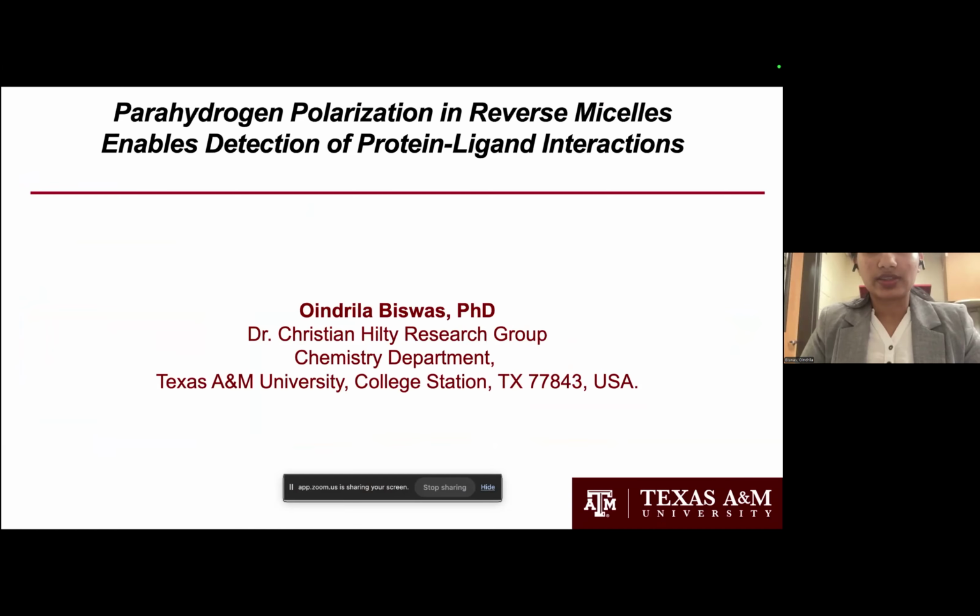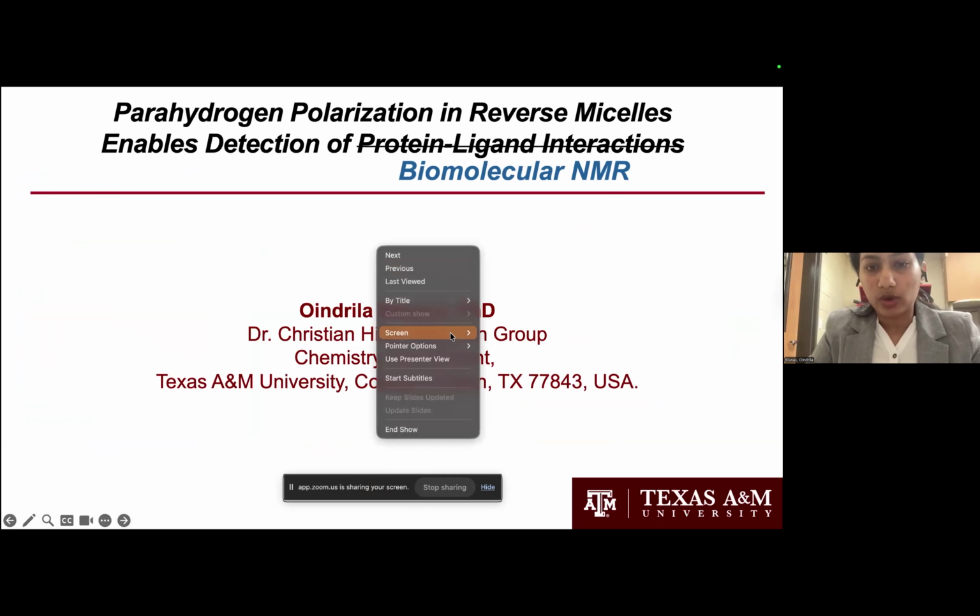Today I am going to present my work about how we use the parahydrogen-based polarization method in reverse micelles to detect protein-ligand interactions. Actually, this method can be diversified to be used for biomolecular NMR.